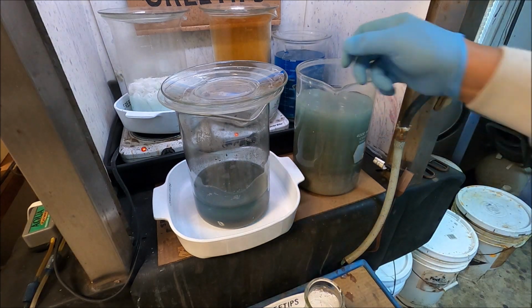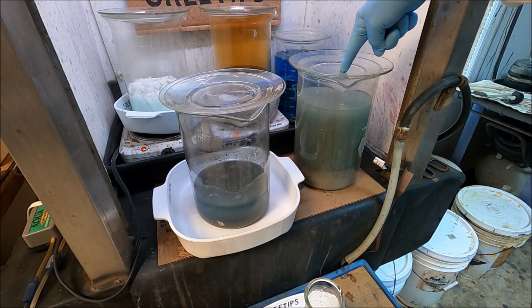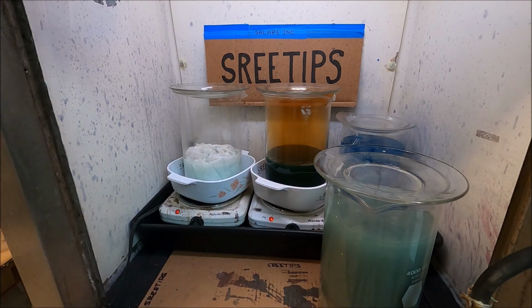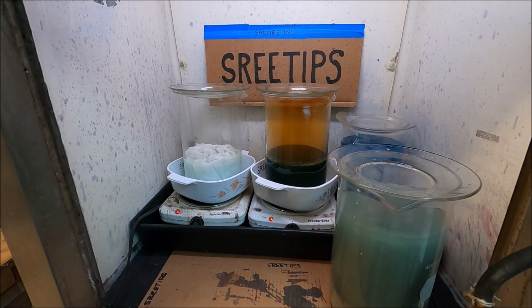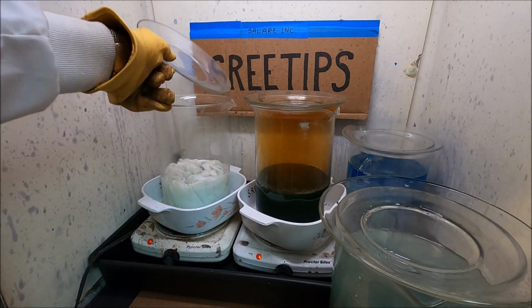And again, this reaction will produce some fumes that are not good to breathe, so we want to do this outdoors or in a fume hood. As you can see, all my big beakers are being utilized here. This is quickly overwhelming the capacity that I have in my shop here. Let's go ahead and transfer some more of this hot solution out of here into our solids.